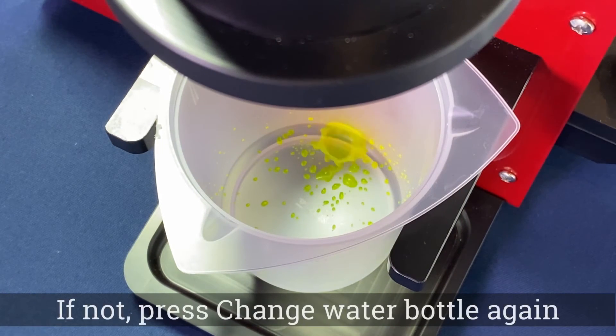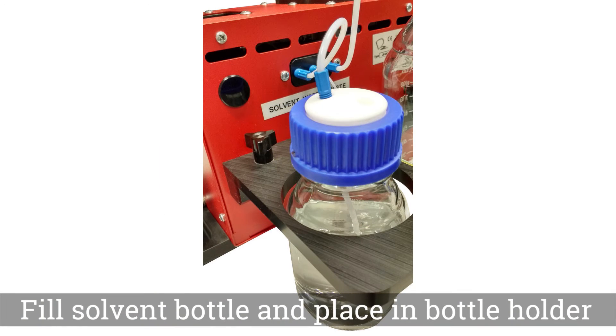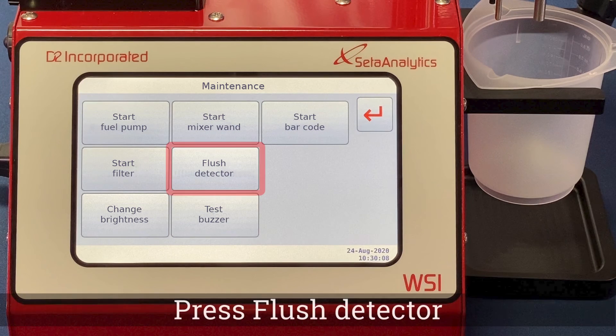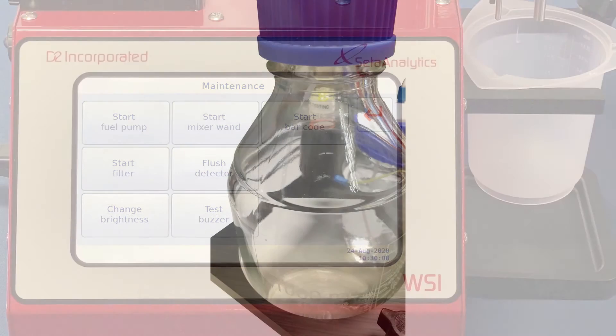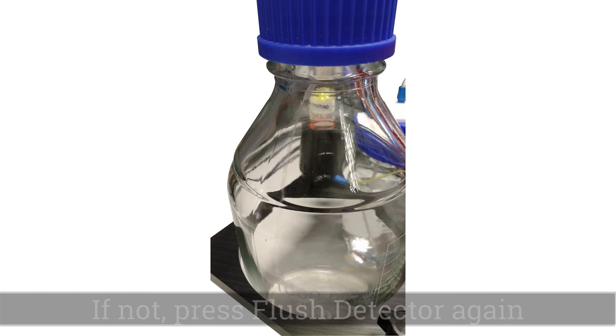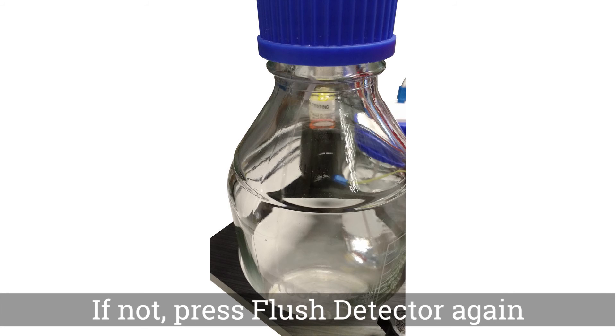If further purging is required, repeat the process. Next, fill the solvent bottle and replace it in the bottle holder. From the Service screen press the Maintenance button, then press Flush Detector. Check to make sure that solvent is flowing into the waste bottle — if not, repeat the process.